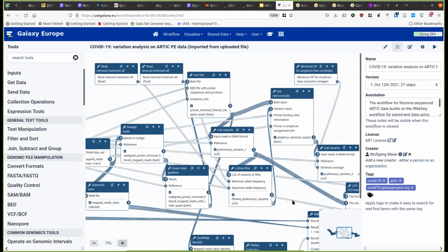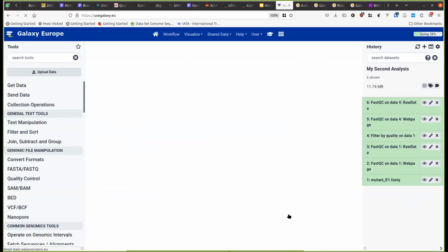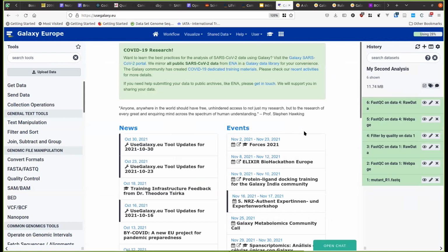In fact, this workflow is used by our National Institute for Communicable Diseases in South Africa to analyze SARS-CoV-2 sequences collected in the country. You know, it's used on wastewater analysis and various other things. So you really can get quite advanced in terms of Galaxy workflows. The one that I was illustrating was obviously just an introductory, quite basic one. Any further questions?